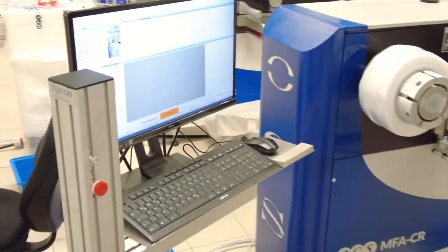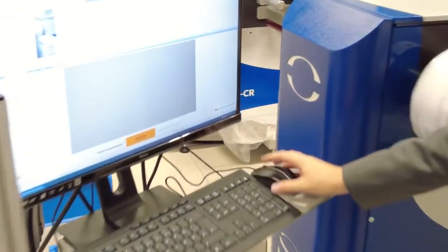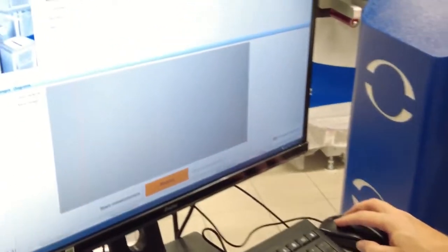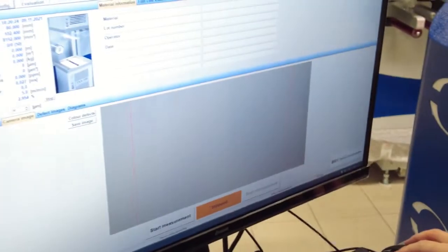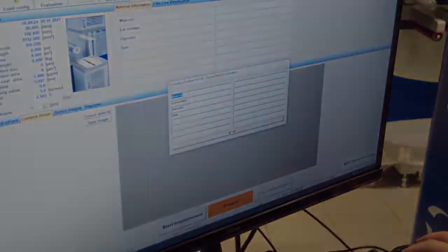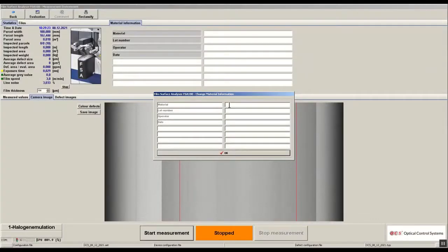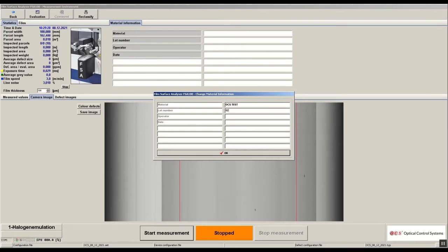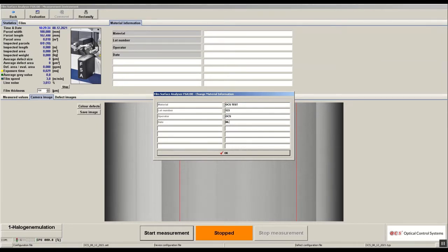Our main focus today is on the FSA 100 software. I would like to swap over to the measurement screen. The material information field will allow you to type in information about the material, the lot number, the operator as well as the date, but all information in the material information field is freely editable.